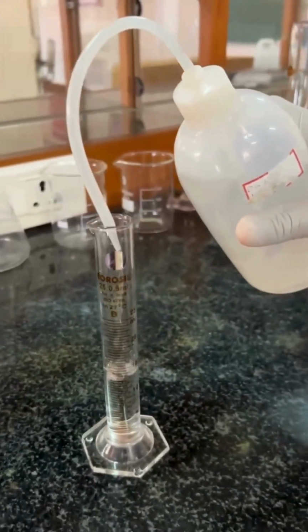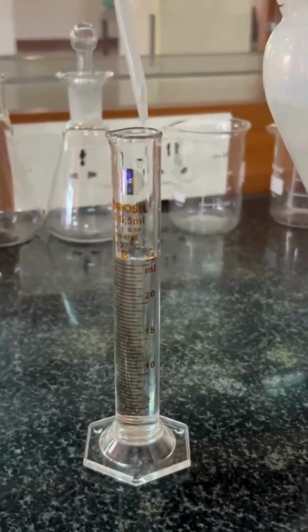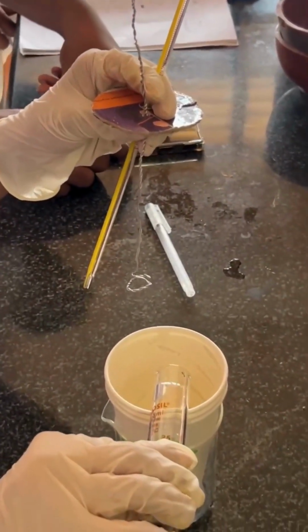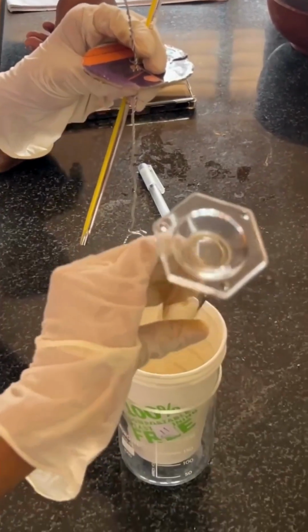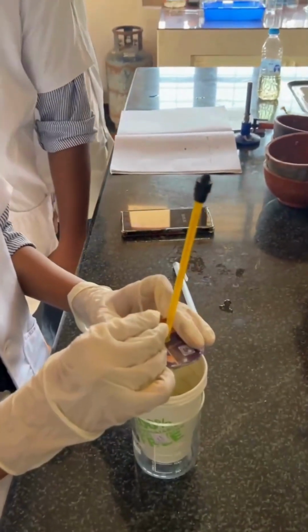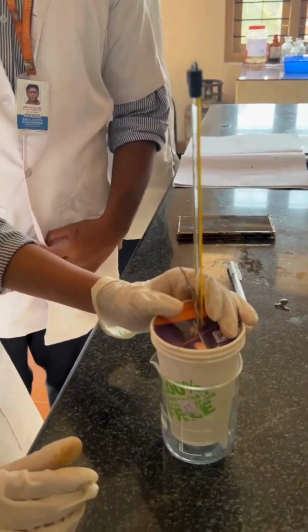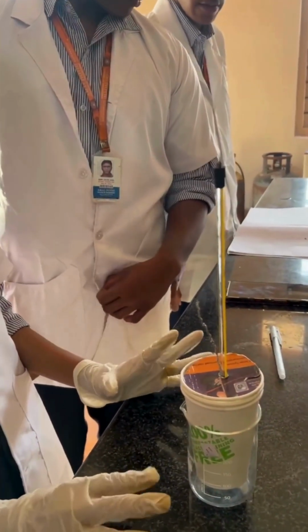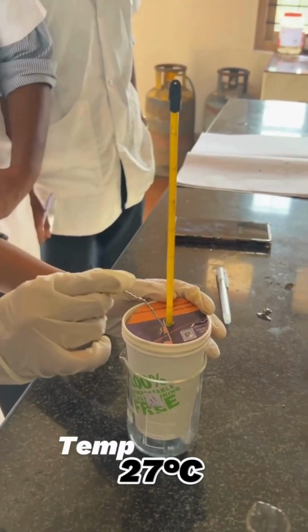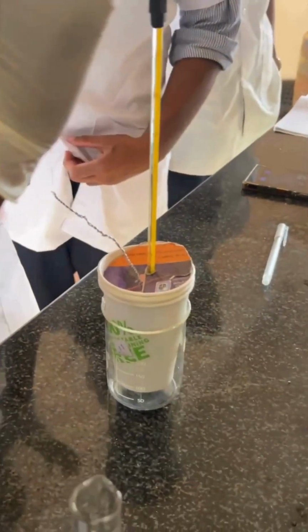Next, we repeat the process with the 6.25 grams of hydrated copper sulfate. The initial water temperature again measures 27 degrees Celsius.